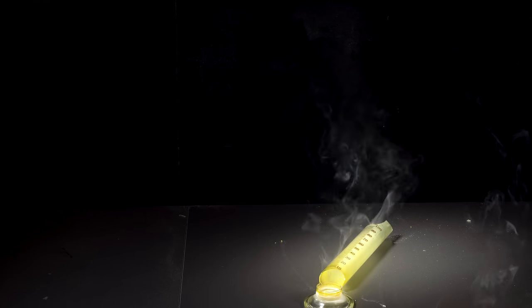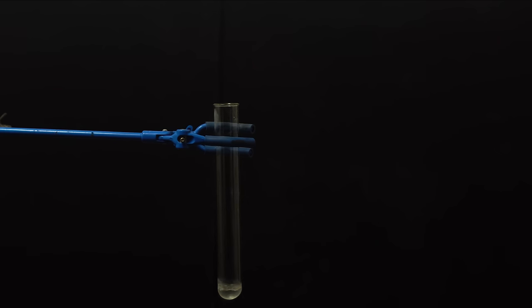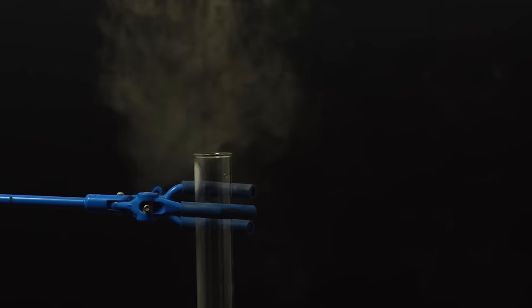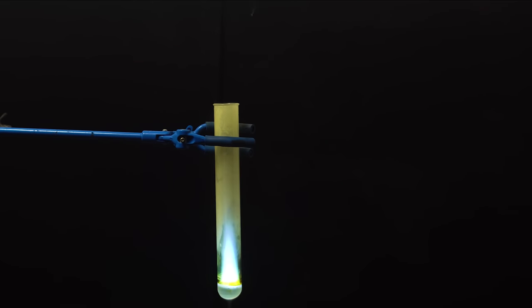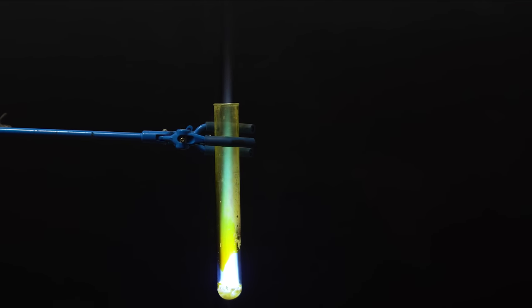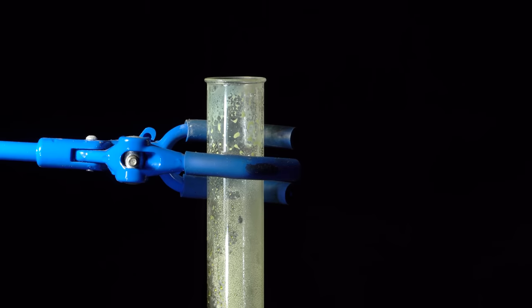Yeah, the measuring cylinder was not quite ready for its sudden changes in temperature. So let's try to repeat this experiment in a heat-resistant test tube. Just like the petri dish in the previous experiment, the test tube got covered with a layer of elemental sulfur.